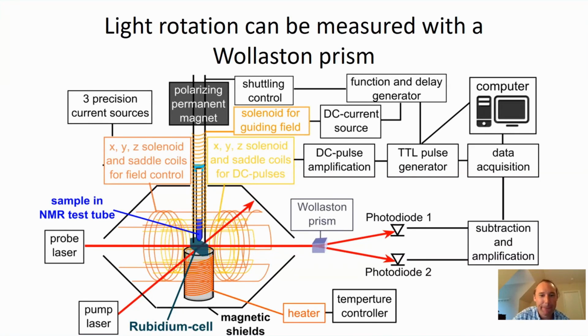Okay, so actually then I can see one more question. How small do you think such an experiment can get? I think the biggest challenge with this type of setup is the shielding of the magnetic fields, right? That you need these big shields to shield it. But otherwise, it can be tiny.